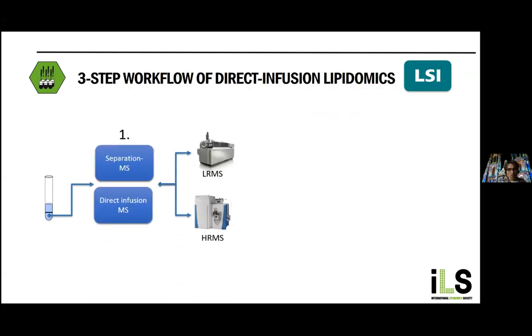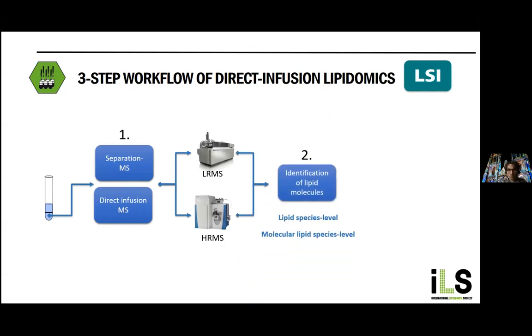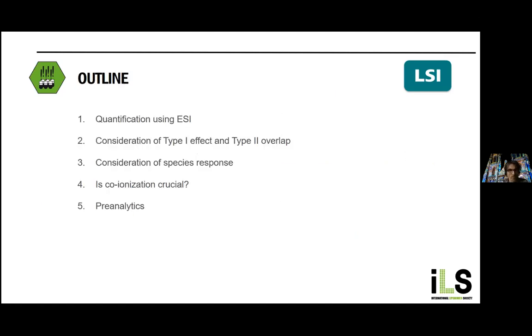Yesterday, you heard a lot about the basic lipidomic workflows, and also about identification of lipid species. In this talk, I would love to focus on quantification of lipid species, and I decided to do that with the following outline. Most of us use electrospray ionization for the quantification. So that is the first part of the talk.